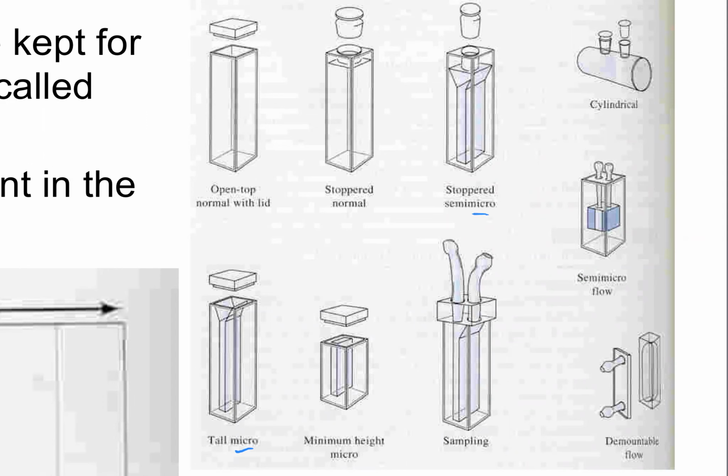It became apparent that even though this cuvette only holds 3 milliliters, which doesn't sound like a lot, certain times, maybe like biochemical type examples, the quantity of material that you have to make a measurement on can be very, very, very small. And the material tends to be very, very precious. Maybe it's very expensive. You can only afford a small amount of it. The quantities involved are very small. In that case, 3 milliliters is just too much volume. Maybe you need 100 microliter sample volume, that type of realm, right?